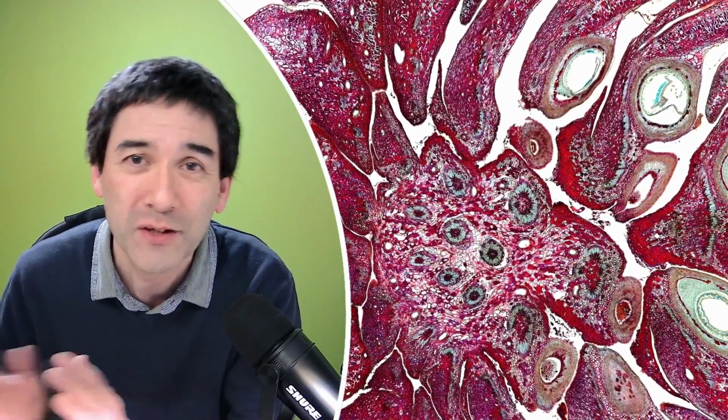And then you're kind of hoping actually that you do not find it in the database, because then this means that you've discovered something new, right? If it's already in the database, unfortunately, somebody else was faster, and the DNA sequence is already in the database. And if it's not in the database yet, or if there's a certain critical percentage deviating, sufficiently different from those in the database, then you can say you've got something new, right?